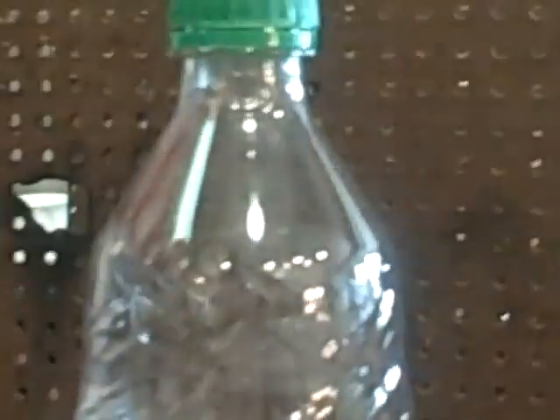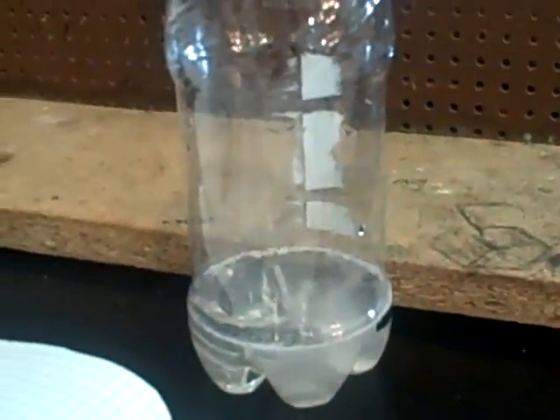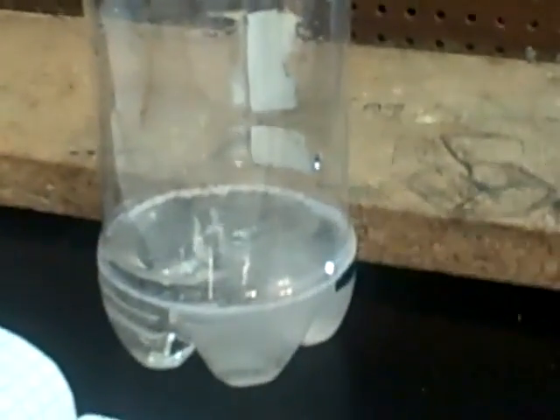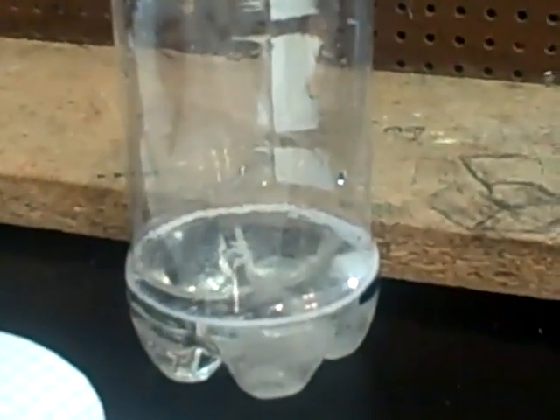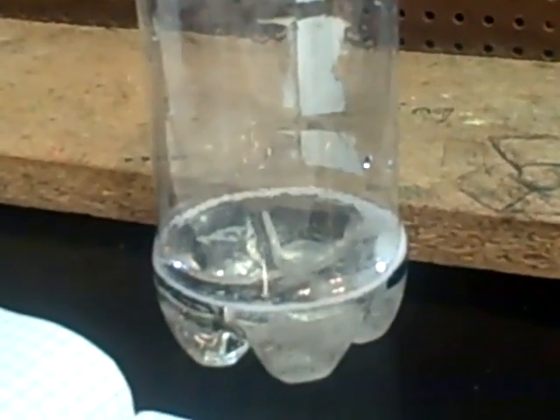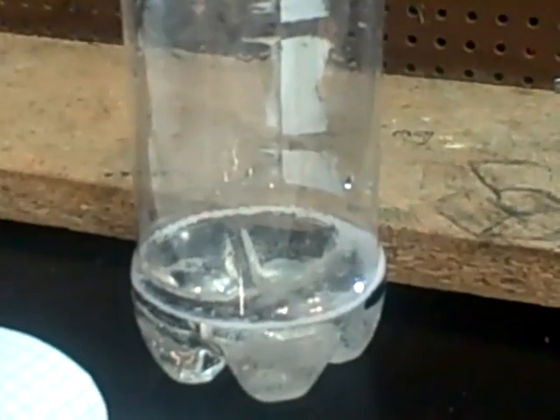Now our Alka-Seltzer is fizzing. Plop plop, fizz fizz, oh what a relief it is. Our Alka-Seltzer has almost reached it — almost done.